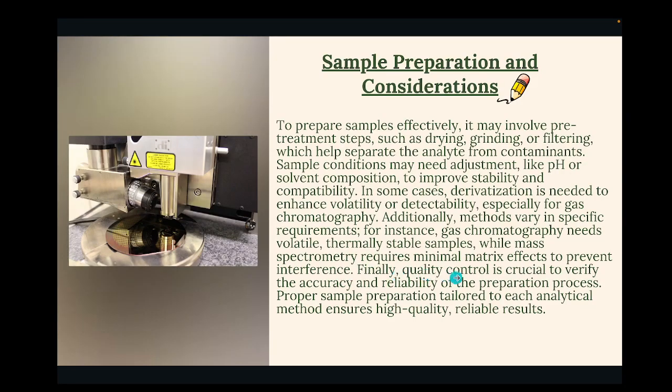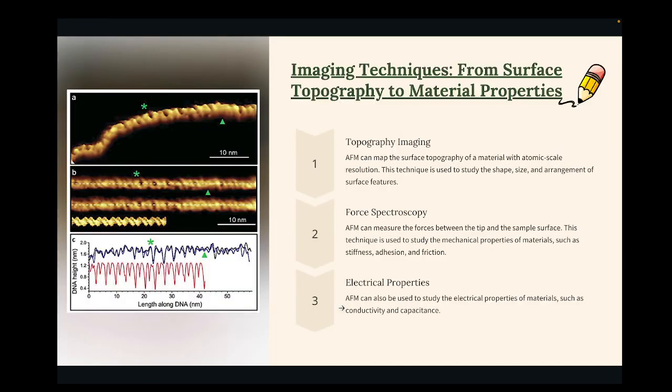Finally, quality control is crucial to verify the accuracy and reliability of the preparation process. Proper sample preparation tailored to each analytical method ensures high quality, reliable results.